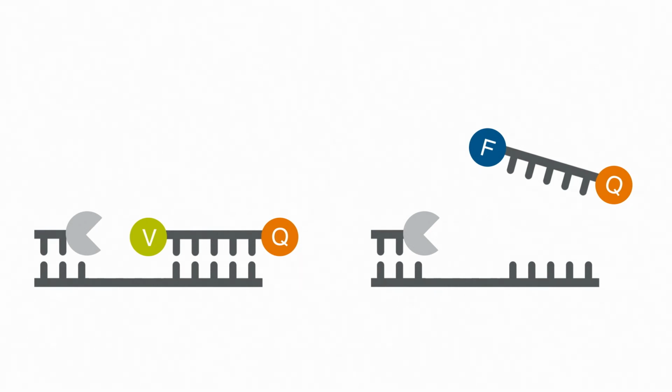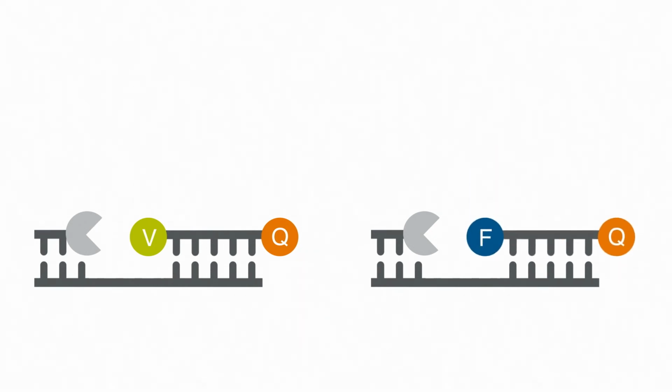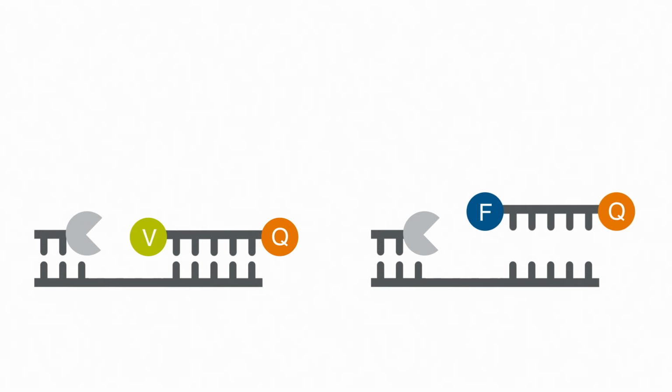But depending on the surrounding sequence, there can be a low amount of mismatched binding from the opposite probe. This is normal, and one of the reasons why assays are a qualitative measure of the sample, not quantitative. The software makes calls based on the dye ratios and cluster orientation, and not the CT values.